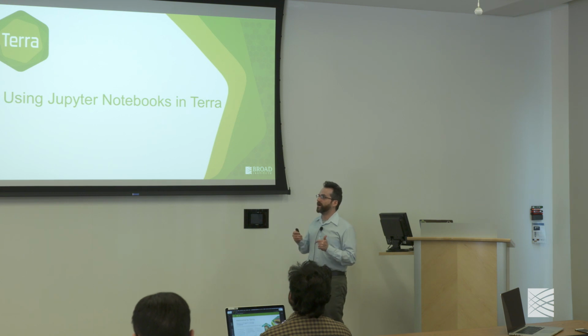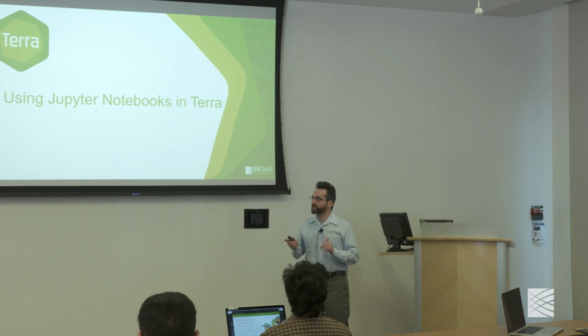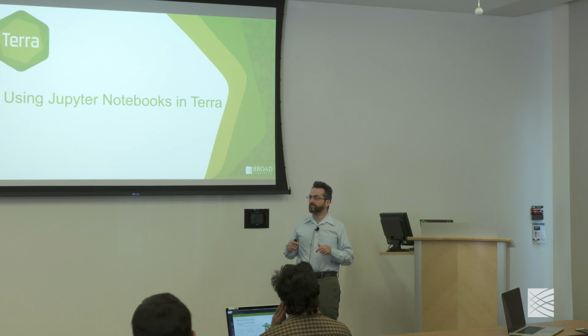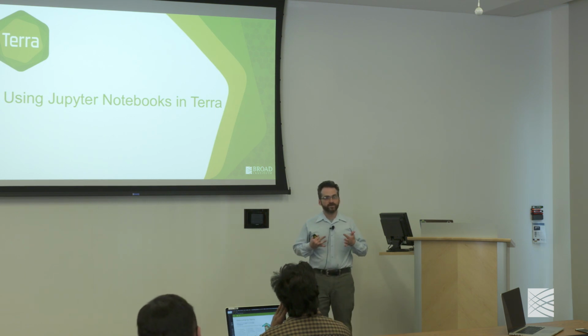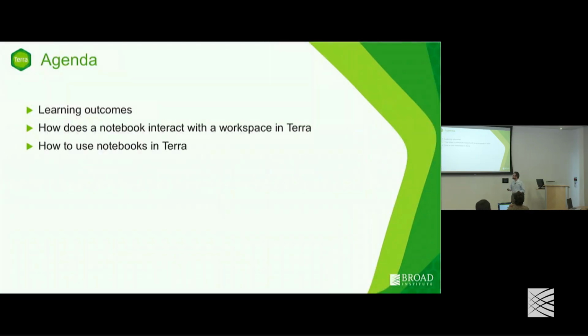I'm going to talk for about 10 or 15 minutes, towards the end of which we'll actually clone a workspace and start up our cluster, and then we'll take a 10-minute break. And when we come back at 10:40, we'll have an actual hands-on demonstration. So you'll actually click through and play with some of the buttons in the Jupyter Notebook.